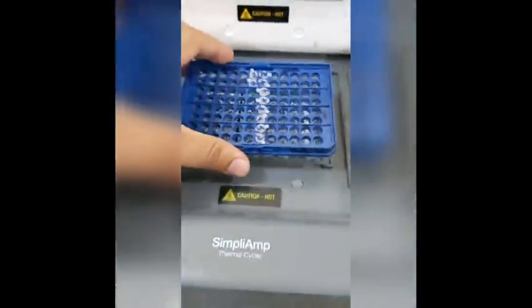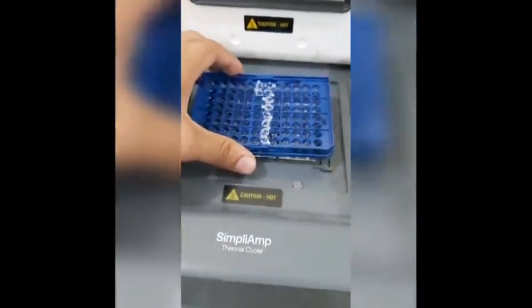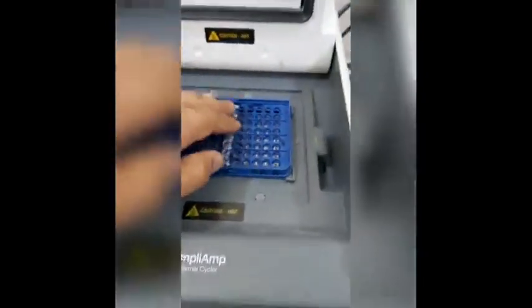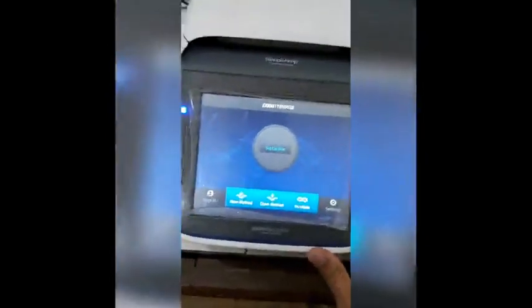After that, introduce the PCR tray into the PCR machine. After placing it in the PCR, close the lid of the PCR machine. Now it's time to run the PCR, but before running it you have to set up a program.